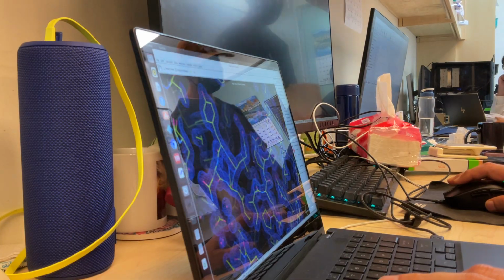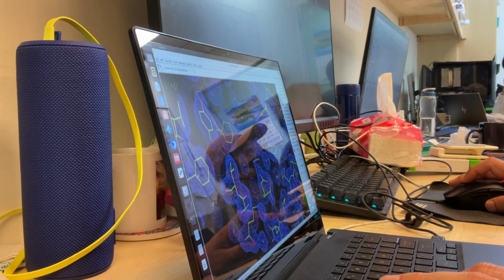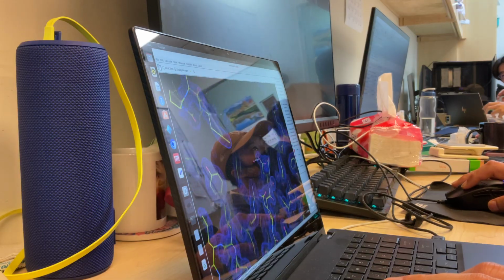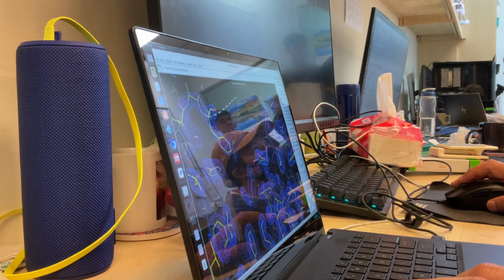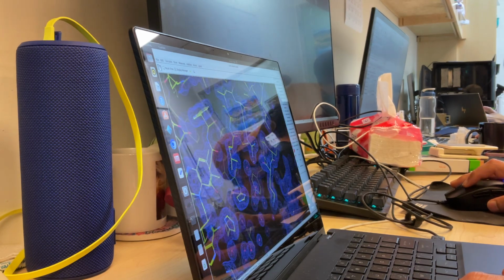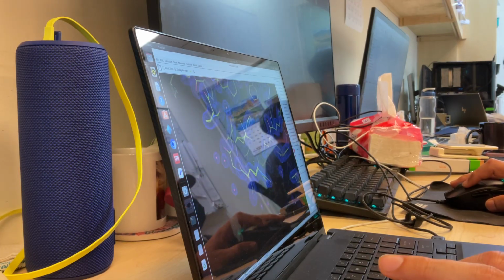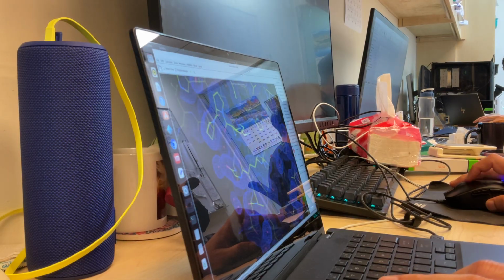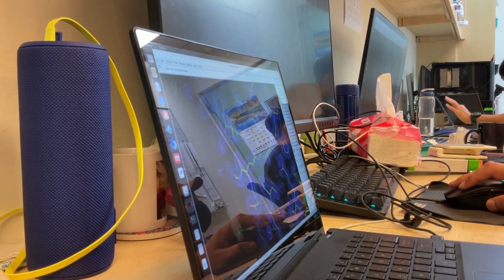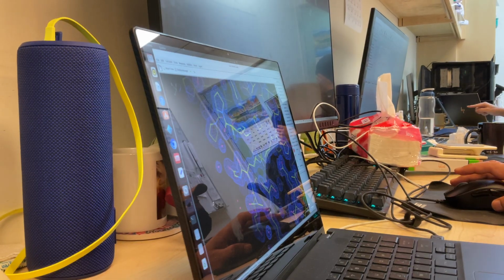And so here we have it. And notice, for example, that this guy doesn't appear. So you see, it only appears later. The reason is that it must have a very high B factor. So that's okay. I mean, if that's the case, that's the case. And so you see, here we have everything the way that it should be. So now we have all the data that we have collected. See, and this one appears, but only at very low sigma. Remember that here we simply don't have really a sigma level because we have no noise whatsoever. Isn't it? Because it's calculated.